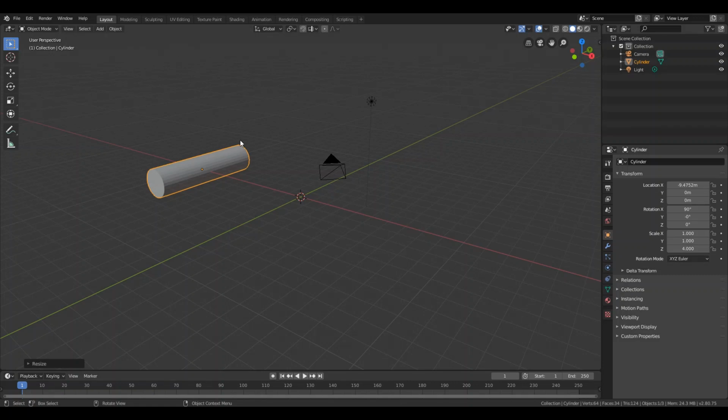and in a CRT TV it's only a couple of lenses. The lenses have to focus on points on a quite big surface, so they make scanning lines. Actually, you know what?